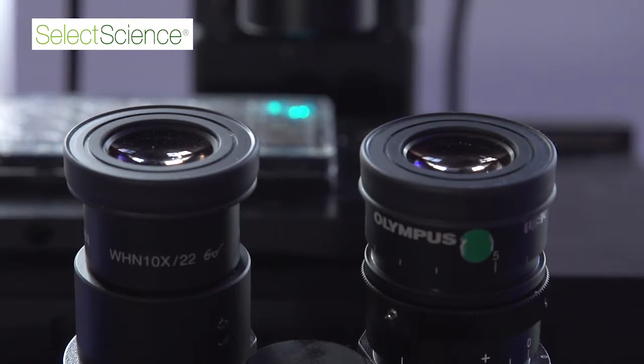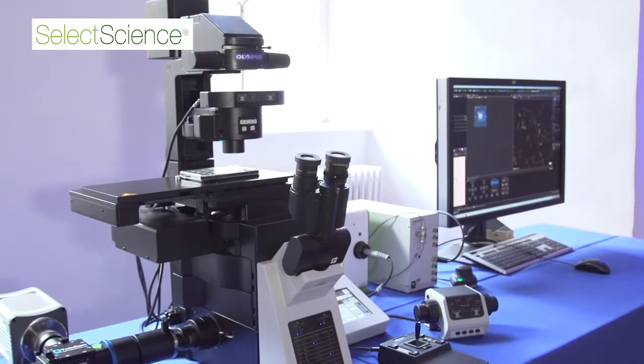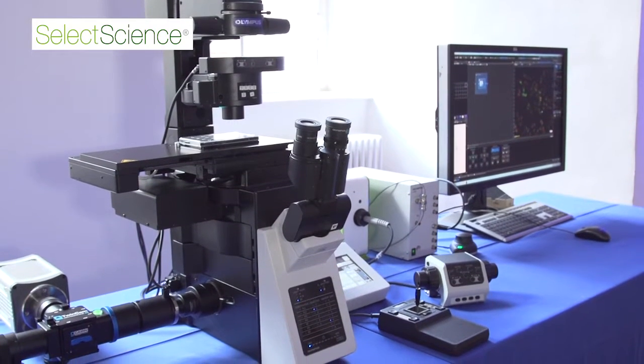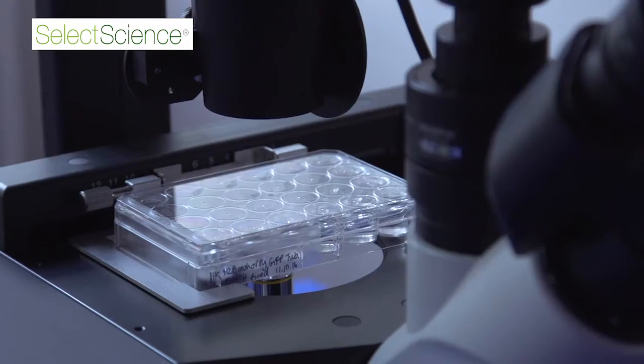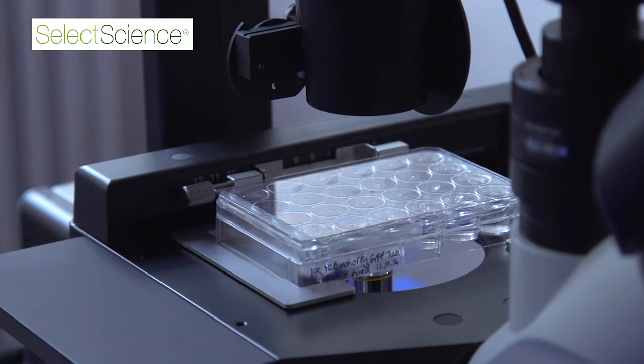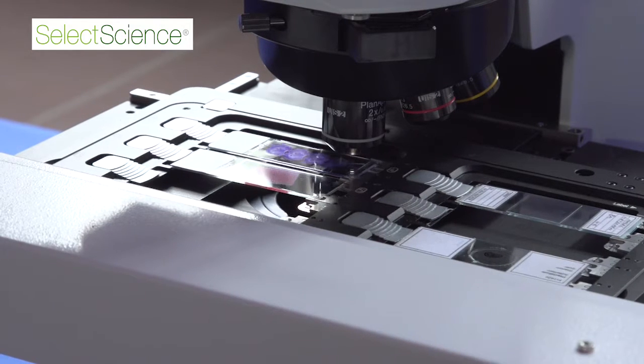We like the Olympus 60 times 1.2 water immersion lens a lot, because it's a very nice objective for spectroscopy. And of course detectors are very important. On the other hand, as we sometimes want to modify our system to bring in our own detectors, we need flexibility. So we need access to incoupling of our lasers, of different lasers, for example. And also on the other side, the detection, we need flexibility to put in our own detectors. We just need flexibility in the system to arrange it how we need it for our purpose.